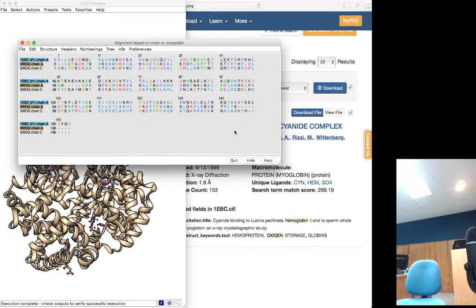Just click OK. For the program, I would recommend Muscle, currently, but that's my personal opinion.